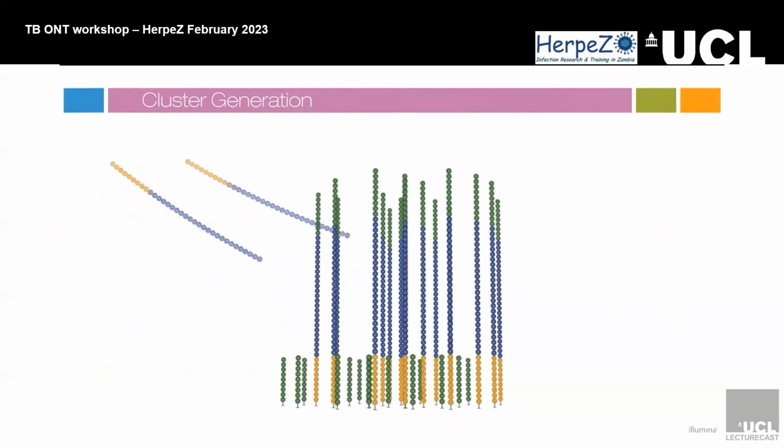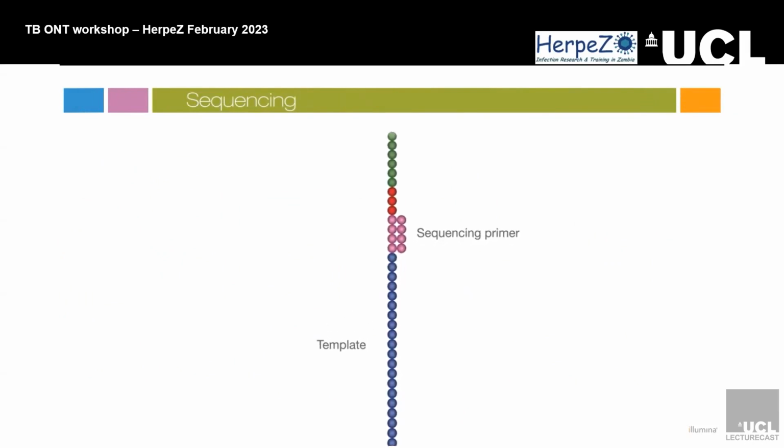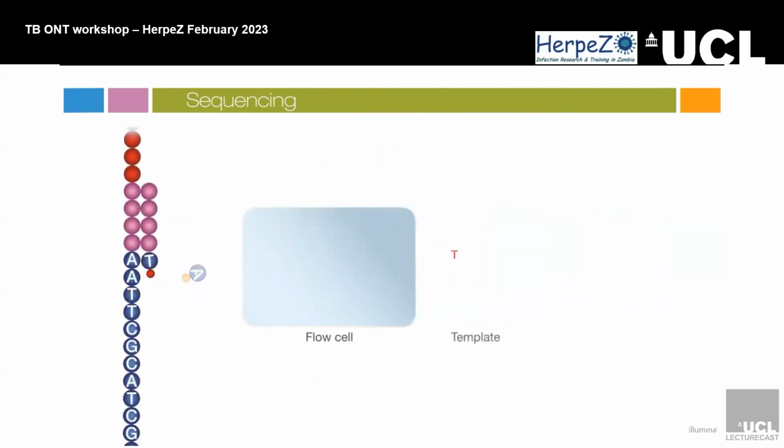Sequencing begins with the extension of the first sequencing primer to produce the first read. With each cycle, four fluorescently tagged nucleotides compete for addition to the growing chain. Only one is incorporated based on the sequence of the template. After the addition of each nucleotide, the clusters are excited by a light source, and a characteristic fluorescent signal is emitted. This proprietary process is called sequencing by synthesis.